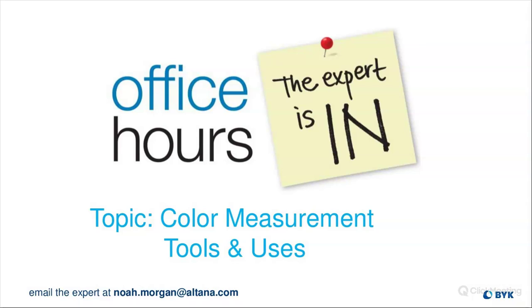And with that, color measurement is a very precise type of science. People see it differently, which creates issues. But when you take instrumentation and quantify those values, then you have hard values to go off of and describe things. Where digital standards start to take a major role is that it creates the ability for one lab to create one set of panels.